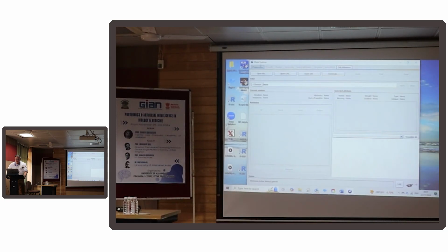So what I'm going to do, first of all, I need to load a data set in. Some important things to know.